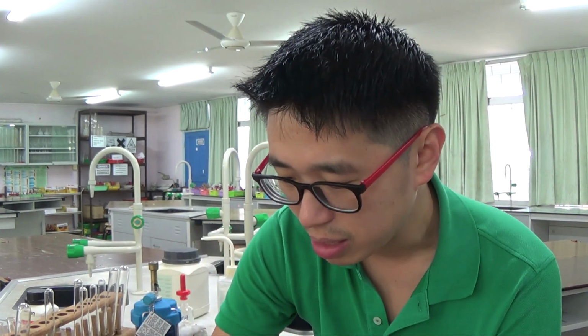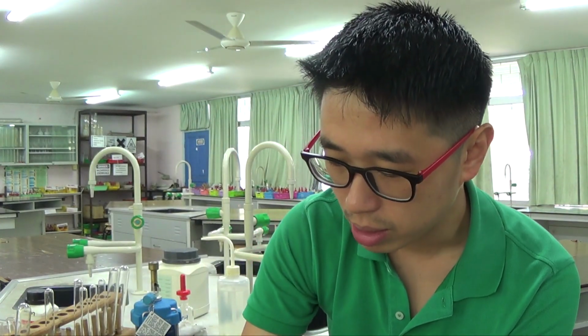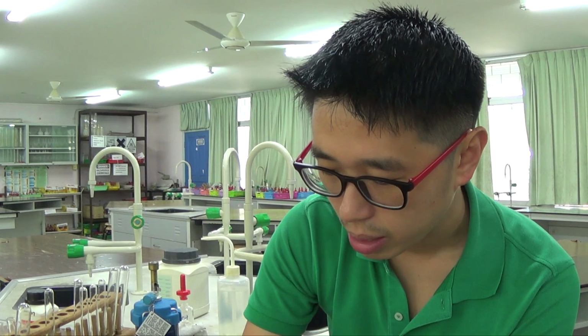So we know that the test for ammonium ion is to add aqueous NaOH, and then you heat it, and then you get ammonia gas.